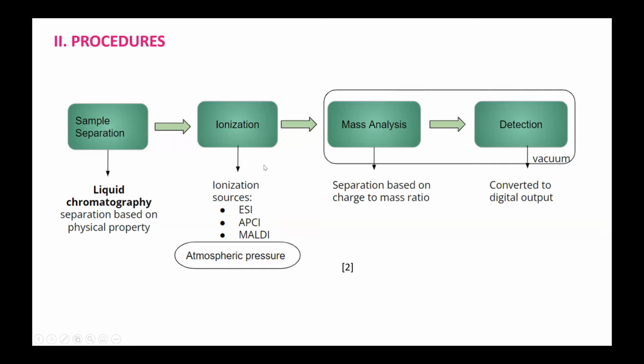Electrospray is the most common one, used for most types of compounds, and it mainly depends on polarity and molecular weight. Atmospheric pressure chemical ionization, APCI, could be necessary depending on the compound, when the electrospray method is not very preferable. And MALDI involves the use of lasers striking a matrix of small molecules to make the analyzed molecules into the gas phase.